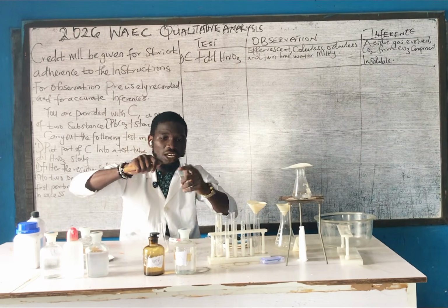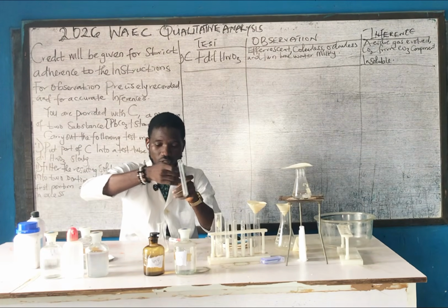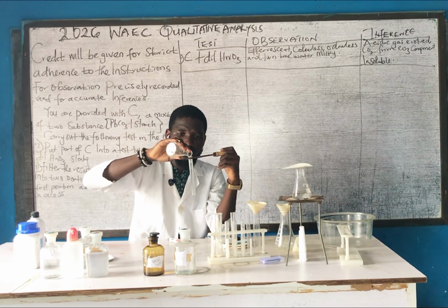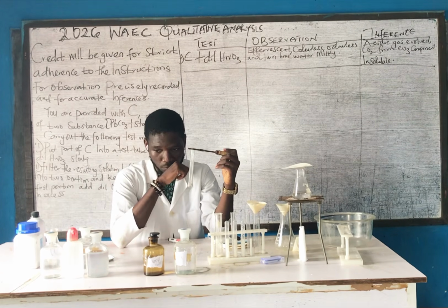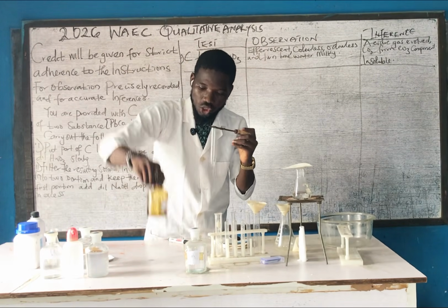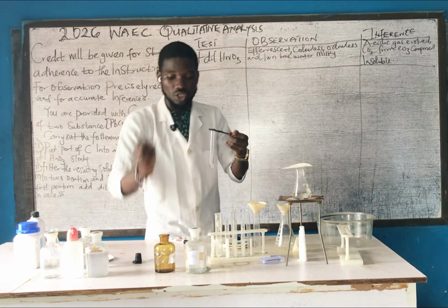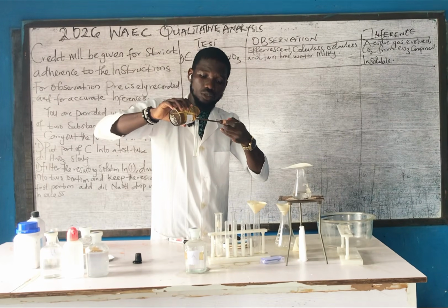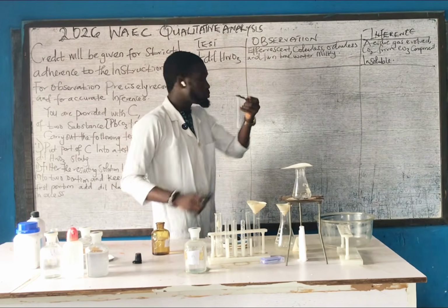So now, here is another test tube. Don't forget, here is the filtrate. You can see the moment I pour the filtrate into this, we are going to pick our sodium hydroxide, because sodium hydroxide is among the materials that teachers are to make use of. So now you can see, be careful in adding drops. If you observe in drops, I have a white chalky precipitate.